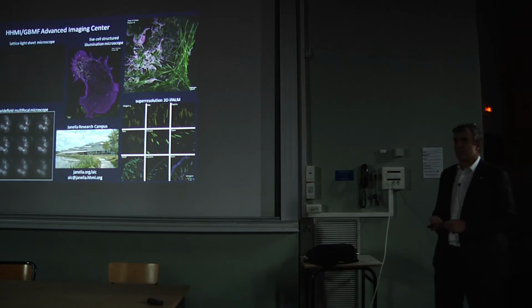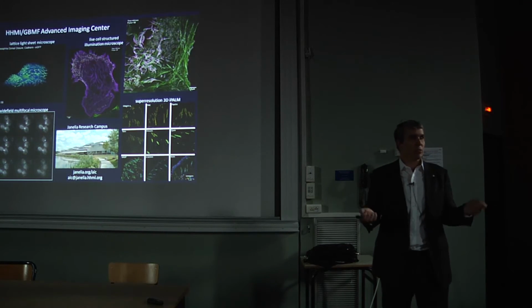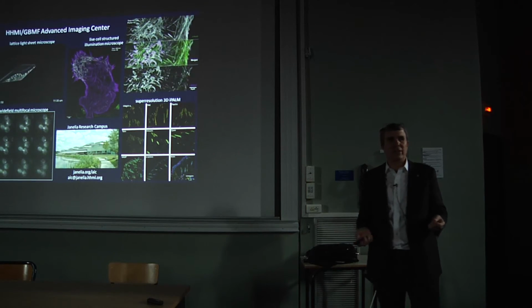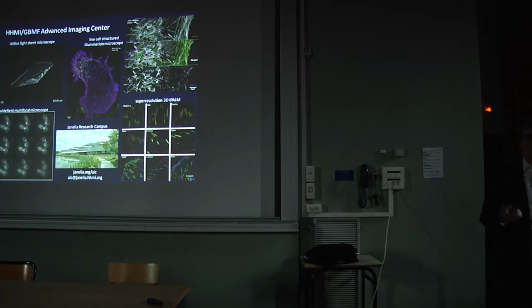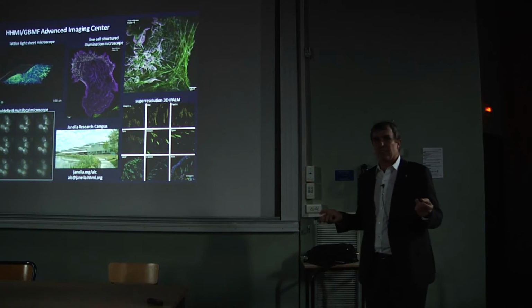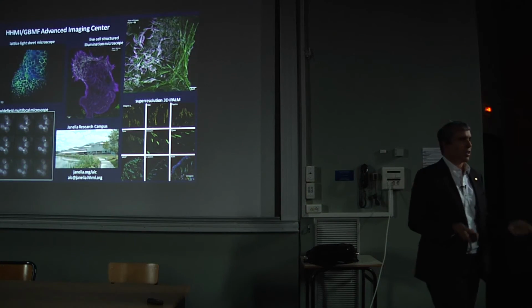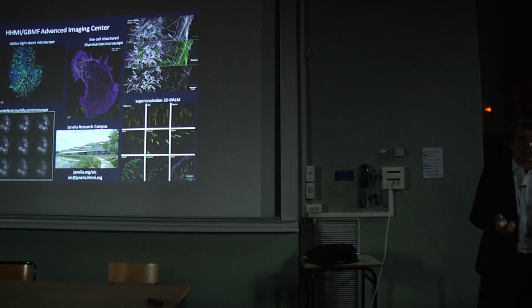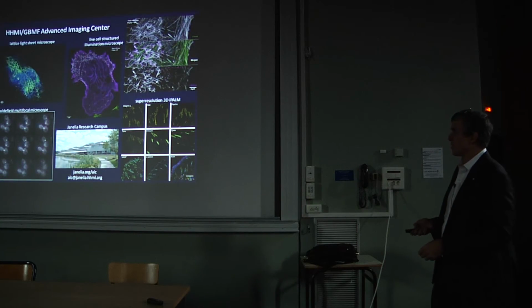And the primary licensee, Zeiss, is working on a turnkey instrument that they hope to bring out to market in a couple of years. And it's not that I care about any of the money or anything like that, but I've been in business myself long enough to understand that the kind of instrument a physicist can make is not the kind of instrument a biologist wants to use. There's a lot of heavy lifting on the developmental side to make a turnkey box so he can focus on his biology and not on the instrumentation.